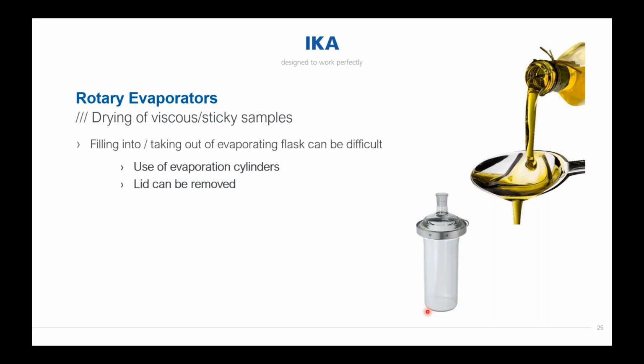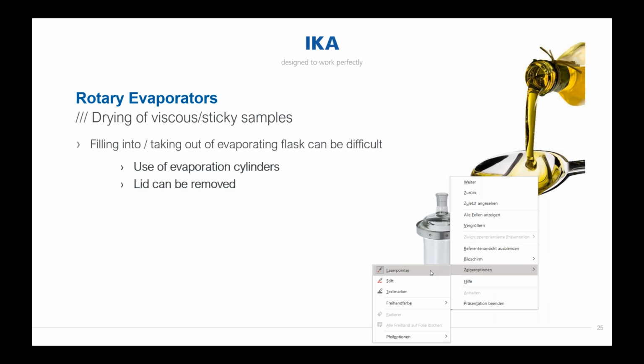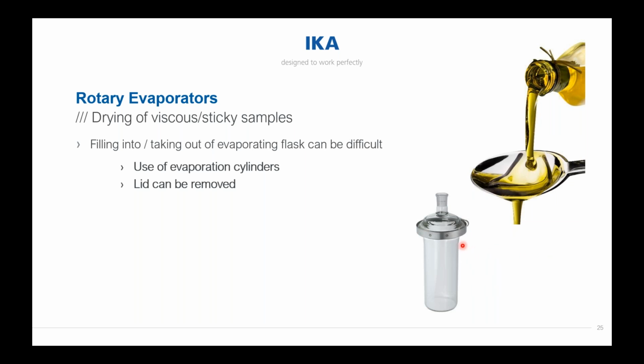So you can fill it easily, and you can of course also remove everything easily by using, here we have the laser pointer. Oh, sorry for this. Yeah, now we have the laser pointer again, and you can use this easily for refilling, for filling, and also of course if you want to fill in your samples.